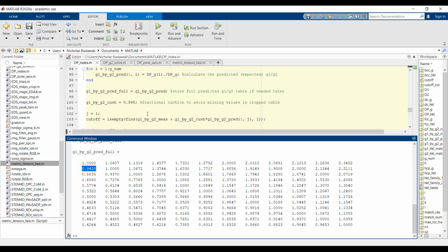So we have measured, oh, I know why. As long as we find measured values greater than that, it's going to do that, because that ratio is always going to be there. That would explain why it's always finding it, because you're very close to 1 with the ratio.